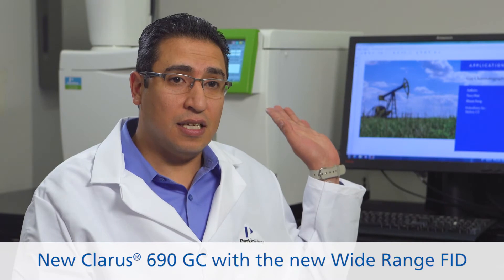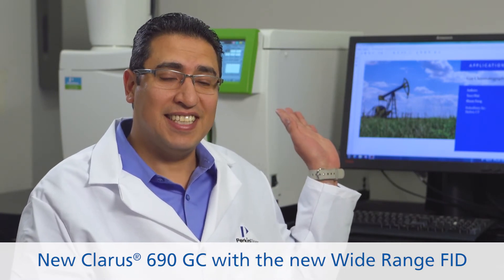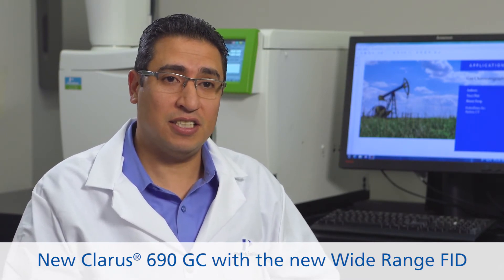I use the Clarus 690 equipped with a liquid auto sampler, a POC (programmable on-column injector), and a wide-range flame ionization detector.